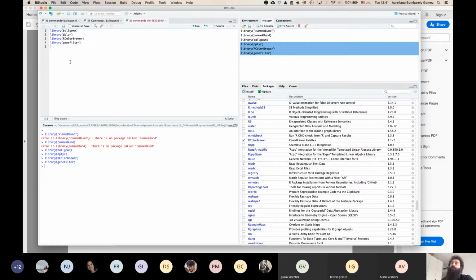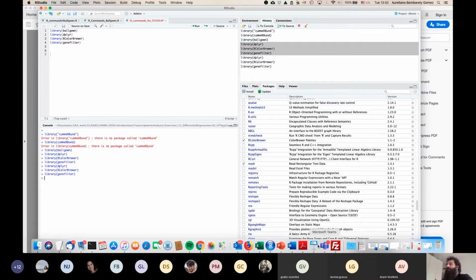I want to pass them to my command. Okay, perfect. So that is the previous step.